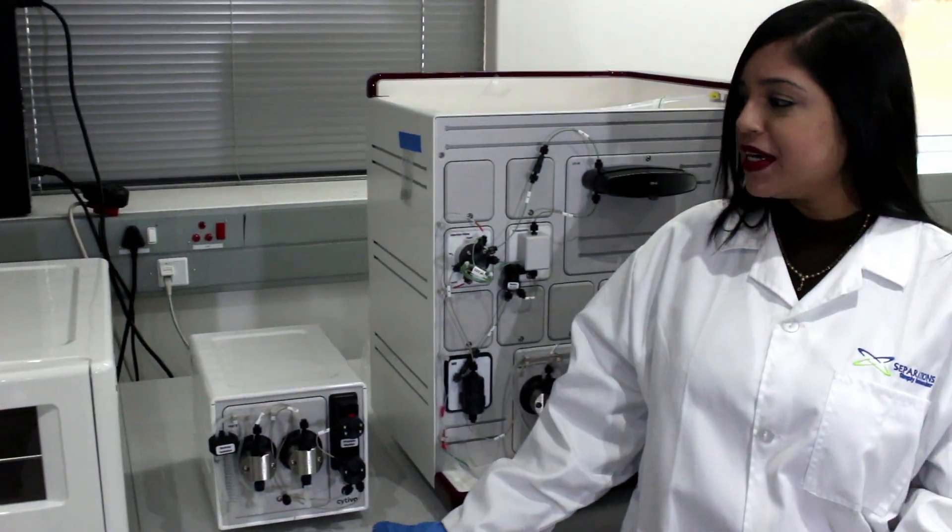Here is the sample pump for automated liquid sampling, and here is the fraction collector for tubes, plates, and bottles.